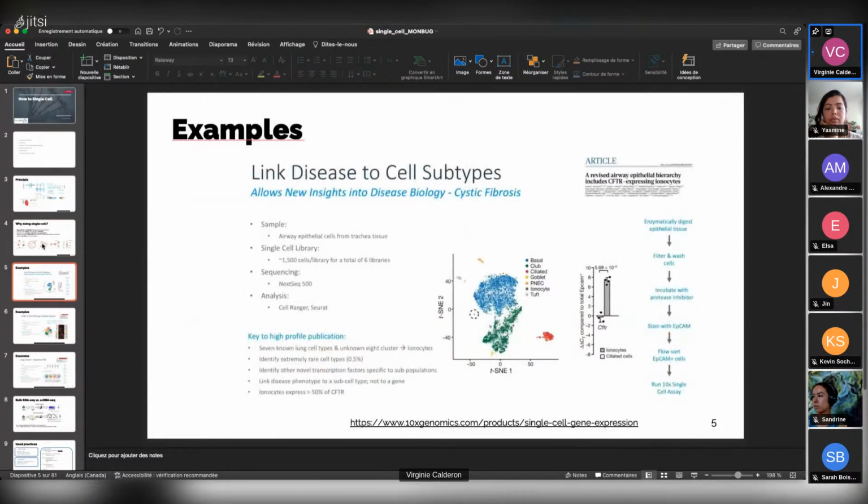So here I put some examples extracted from the 10x Genomics website. So today I will talk a lot about this technology because this is the one we are using at IRCM. But there are a lot of protocols to do single cell experiments. So here in this example, they used the single cell experiment to link a disease to a cell subtype. So in this case, they have identified 7 known lung cell types. Here they are listed, but using a single cell experiment, they were able to detect a new subset of cells.